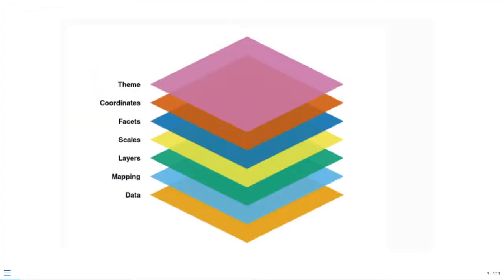The concepts we'll be going through today include the individual layers that make up a ggplot2 style object. When I first envisioned this lesson, I wanted to go big. I wanted to show you how to do a dot plot, a line graph, and flow cytometry plots. But in getting everything assembled, I realized that would be overkill to put into a single lesson. So we're going to focus mostly on a dot/box plot style, but these concepts are equally applicable when we start looking at other styles of plots over the next couple weeks.